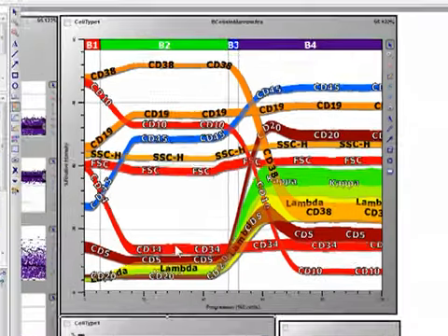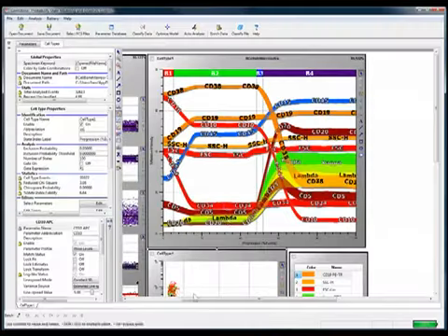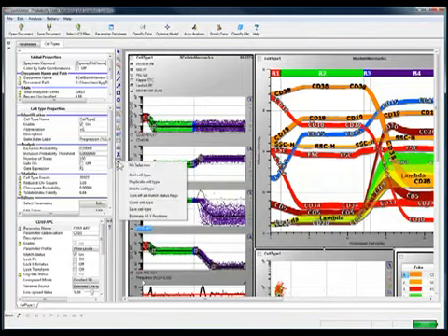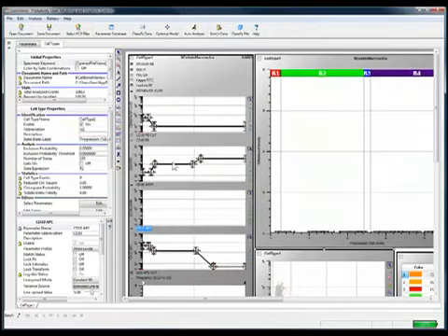So how did Sam put this model together? Let's take a look and see what Sam did. In order to put this system back into the same state it was when Sam started, we're going to go ahead and click this option, and we're going to turn off all the match status flags. Okay, looks like pretty much everything disappeared when you did that.